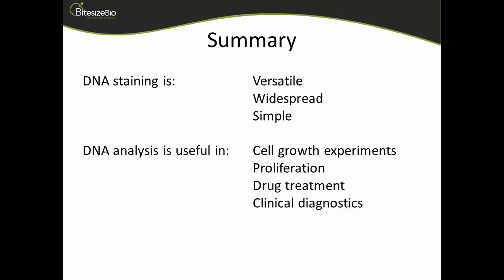So it may be that you have to change the way you look at the DNA content, for example. If you're looking at a surface-stained molecule, something like CD14, dyes like FITC, for example, will survive ethanol fixation very well. So we can stain our cells with surface marker, fix in ethanol and do our DNA staining, as we talked about, with the iodide. If we find that we can't do that, then we might have to think of using a different approach. We might use a formaldehyde fixation, which means our DNA profile may not be quite as good, but it would keep the surface staining intact. Or maybe if that doesn't work, we would use a vital dye, where we would stain our cells but not have to fix them and get that information.